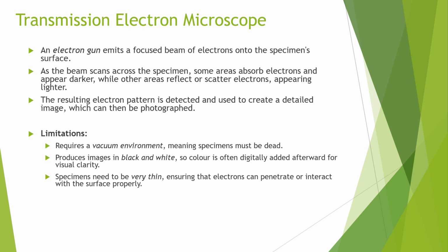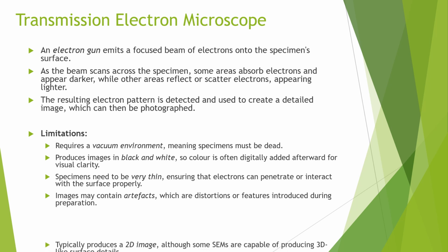Additionally, TEM images sometimes contain artifacts. Artifacts are distortions or visual features introduced by the preparation process, which can make it hard to distinguish whether a feature is genuinely part of the specimen or just an artifact from the imaging process.